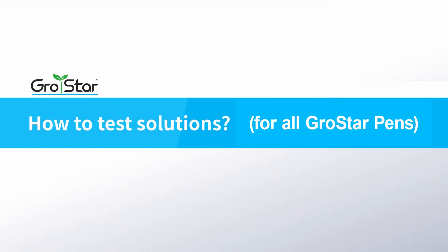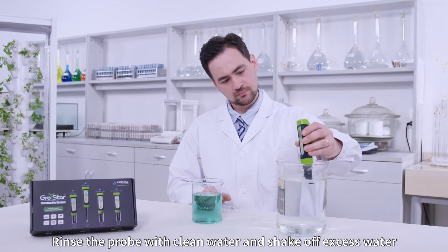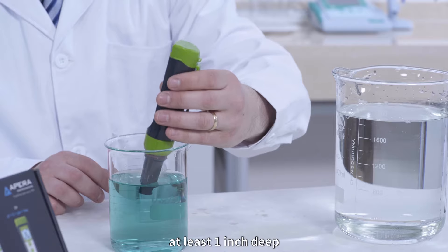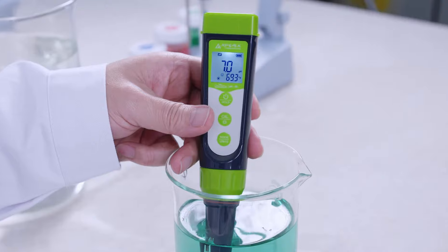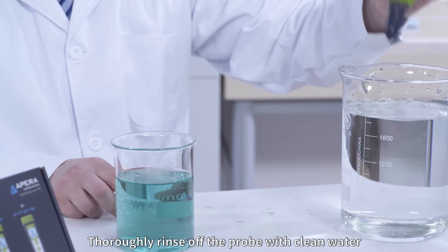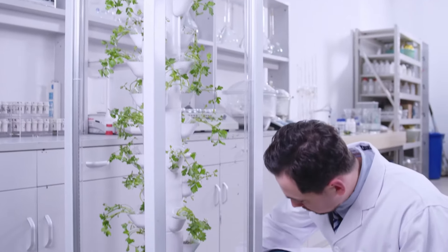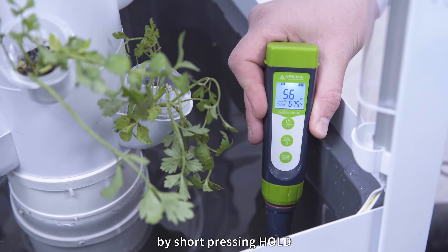How to test solutions. Rinse the probe with clean water and shake off excess water. Fully submerge the probe into the solution at least 1 inch deep. Make a quick stir in the solution. Hold the pen and wait for the reading to stabilize before taking the reading. Thoroughly rinse off the probe with clean water, then close the probe cap. If necessary, you can manually hold the reading by short pressing Hold. Press it again to cancel the hold.